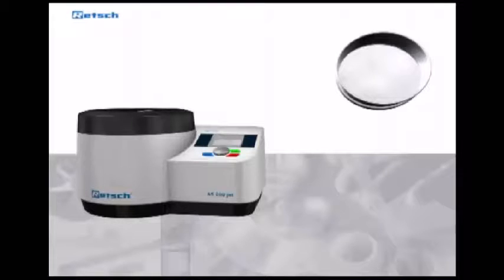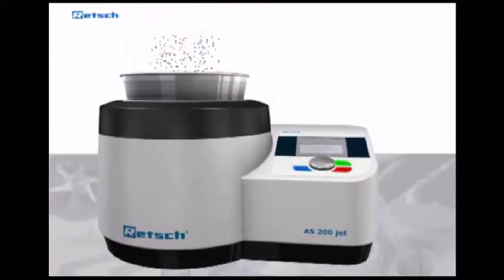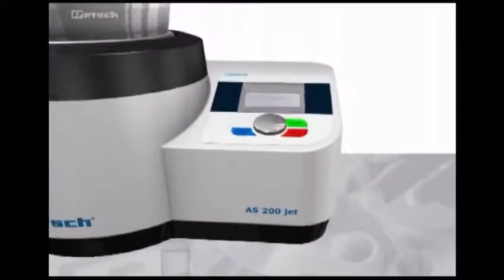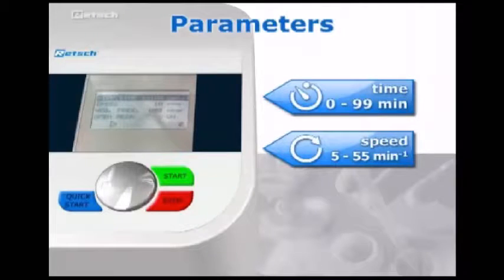A typical air-jet sieving process begins with the placement of the sieve on the nozzle compartment. The sample is then poured on the sieve mesh, and the dust-tight cover is placed on top of the sieve. When the required parameters such as time and revolutions per minute have been entered, the sieving process can be started.